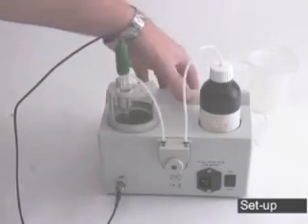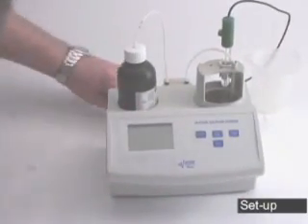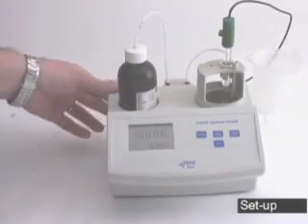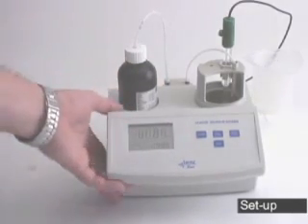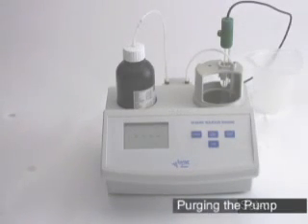Now spin your meter back around, plug it in, and turn it on. Once you turn the meter on, it's going to go through a quick self-diagnostic test. When it's done, it'll display four dashes across the screen.